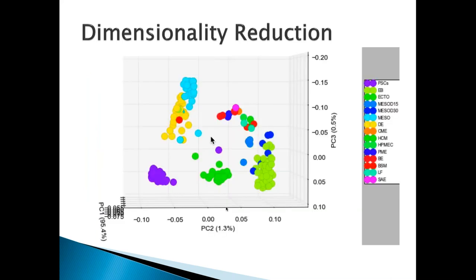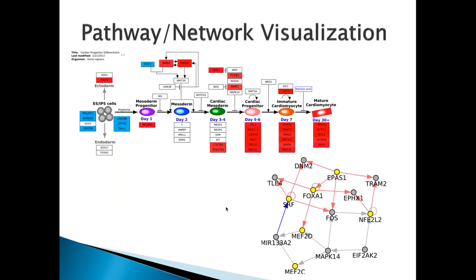This is an example of a 3D visualization plot — these are actually bulk RNA-seq samples collected from pluripotent stem cells and other differentiated products. The colored balls represent different samples and their relationship to each other within the variance associated with the top three principal components.